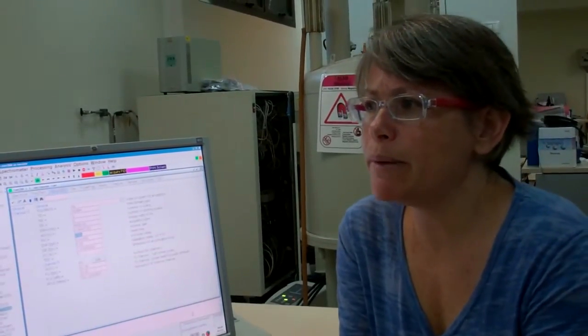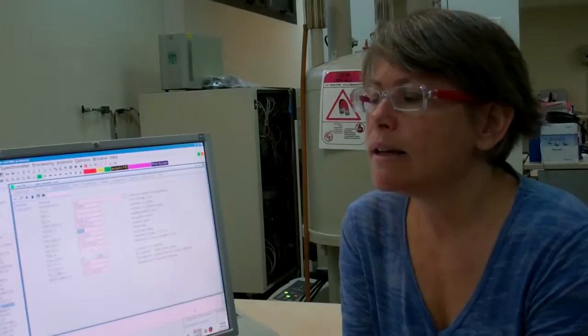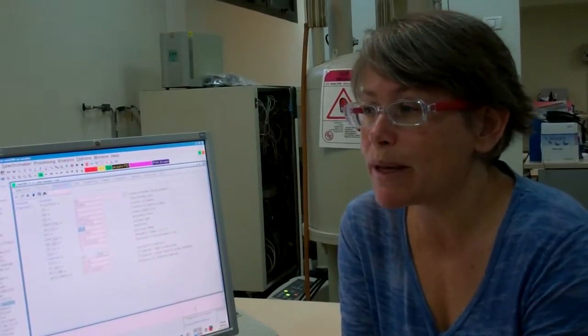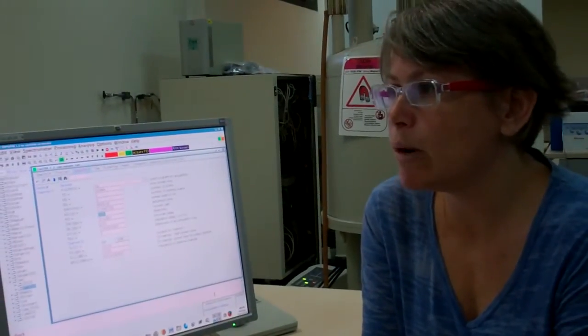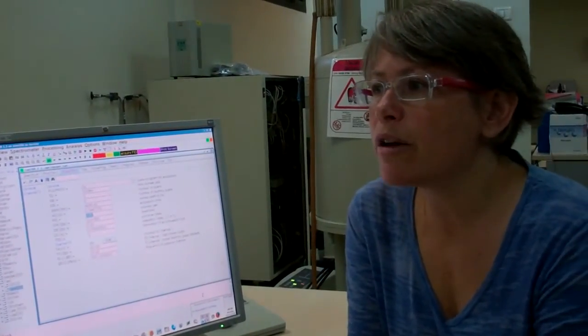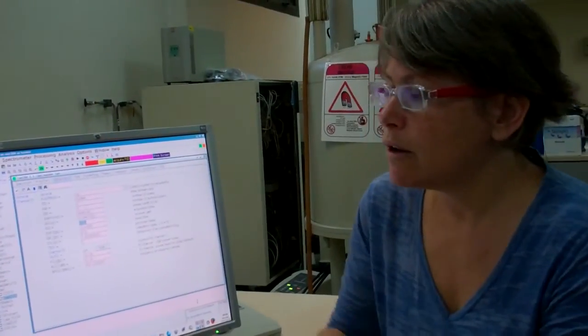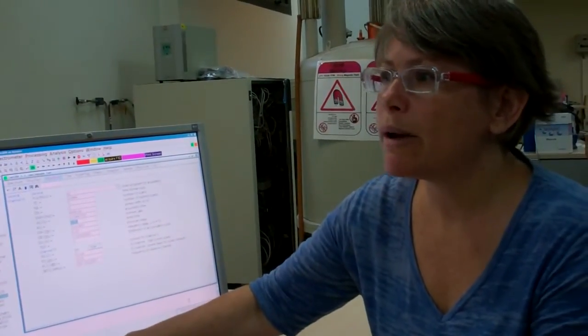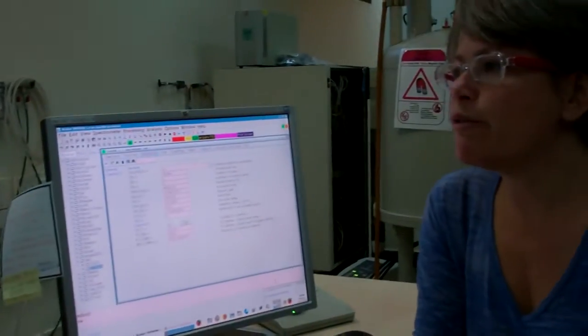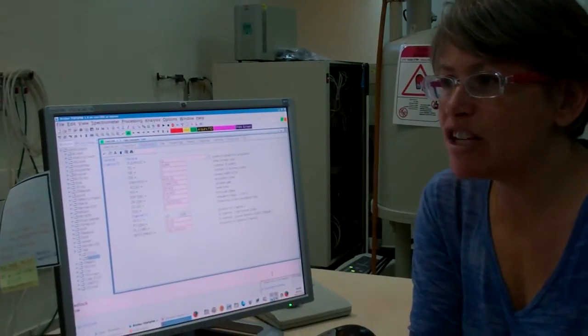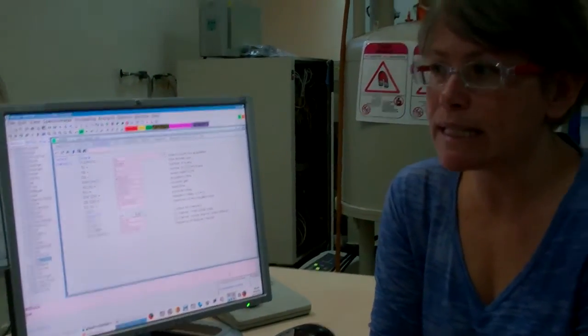This is step number 7B of our instructions list. How long it takes the computer to determine the best RG value depends on the parameters AQ and D1. The bigger those values, the longer the RG routine will take. We can see what the automation routine is doing by looking at the blue-lettered status report at the bottom of the screen. Once the program converges on an optimal amplification value, which depends on the intensity of the strongest signal in the sample, it will say RGA finished, and a new value for RG will automatically appear in the table.